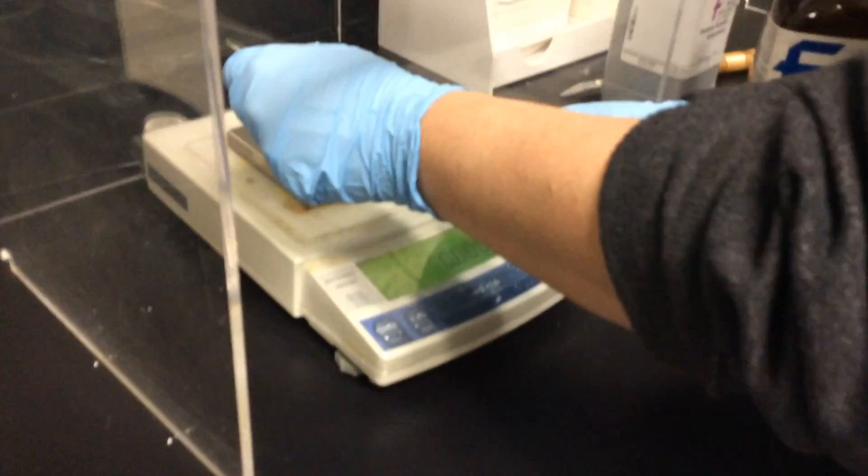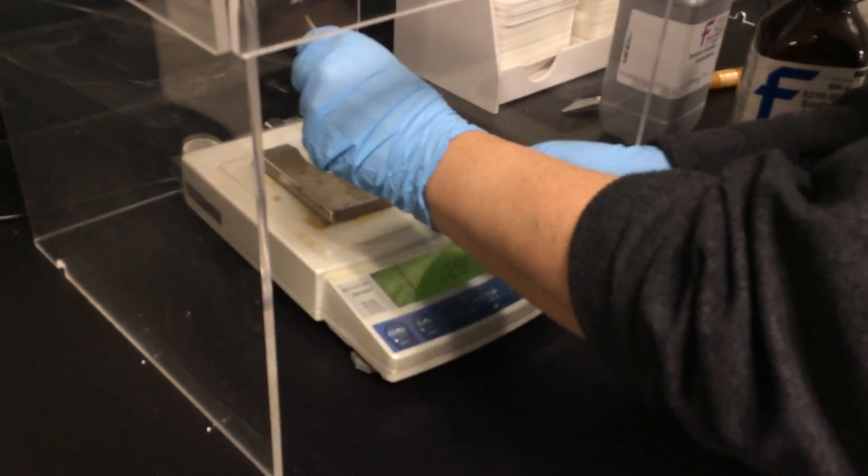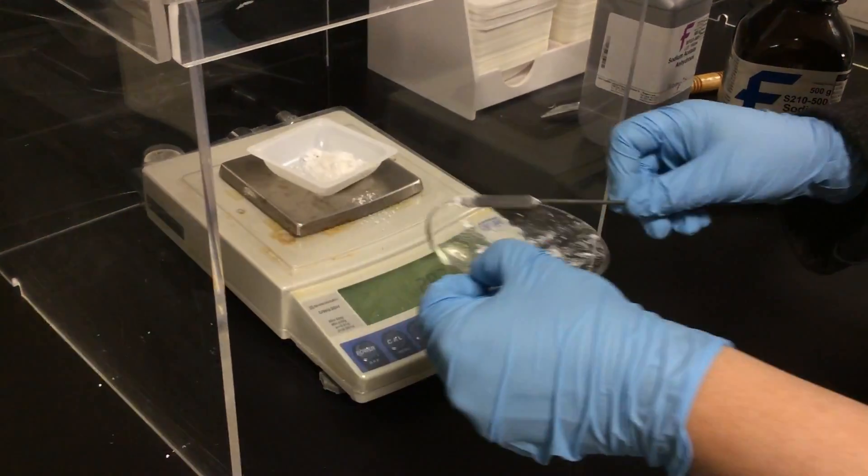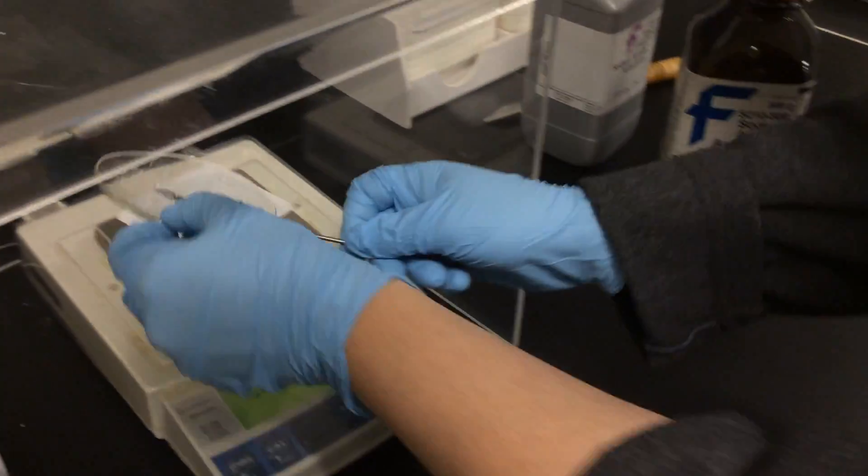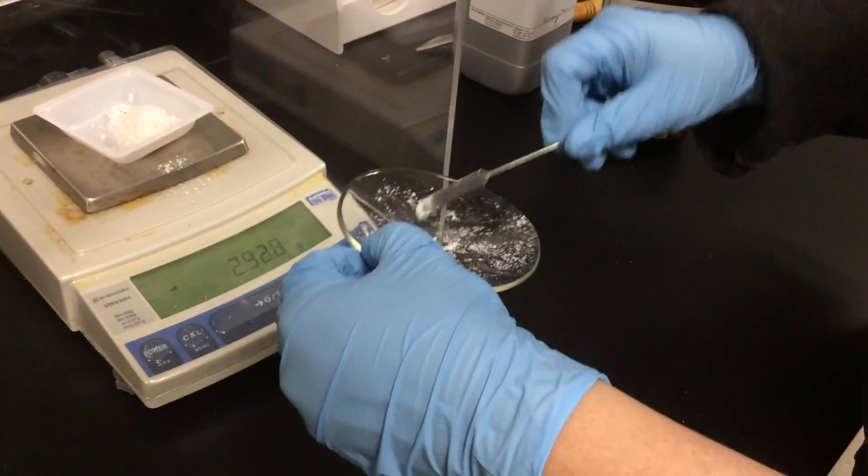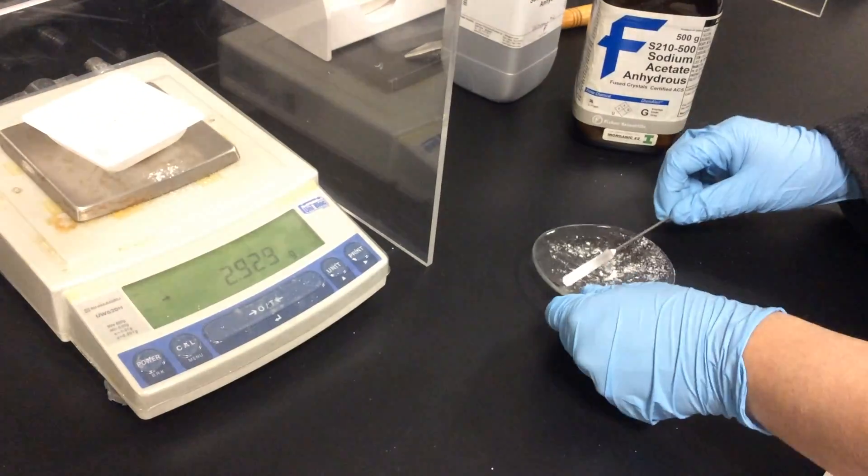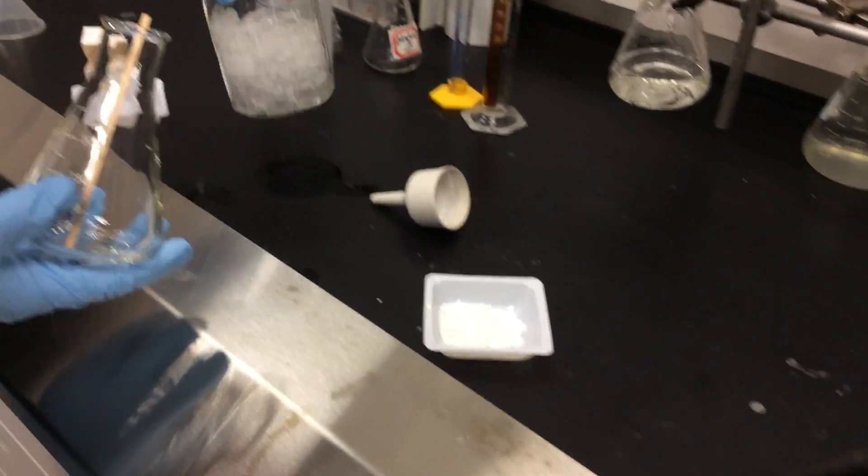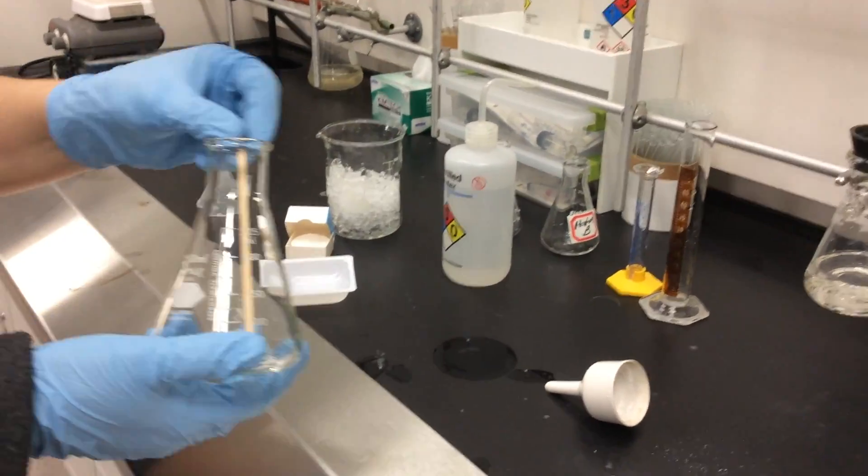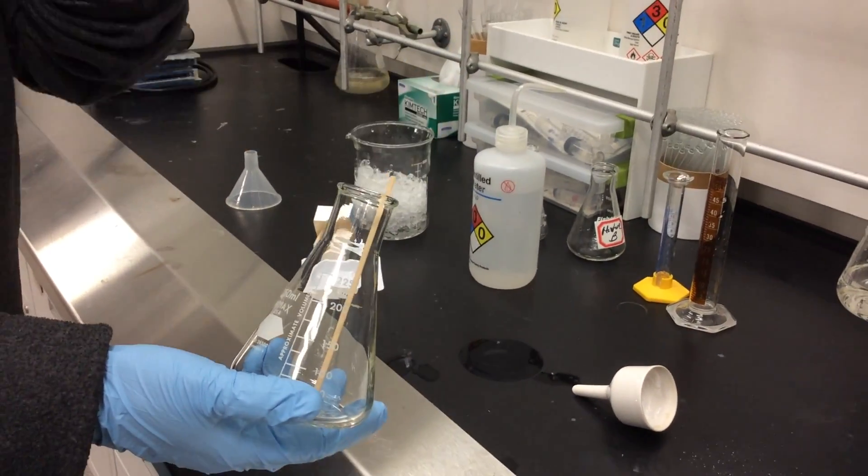Now we need to weigh our crude crystals. You can see we're putting them into a tared weighing boat. Once we have that, if there's a little bit of crystals left on the watch glass, we can leave that for a melting point.